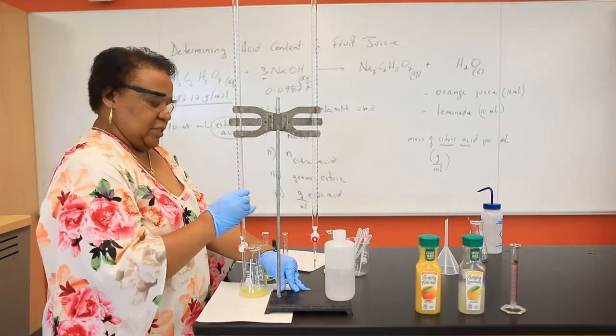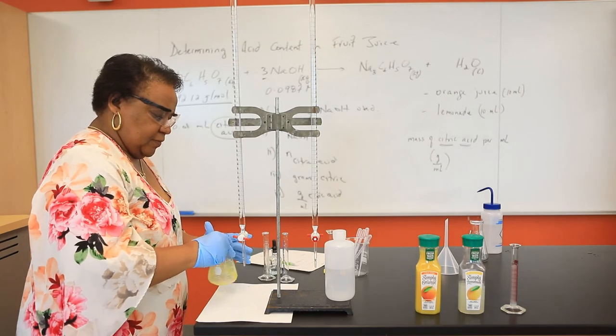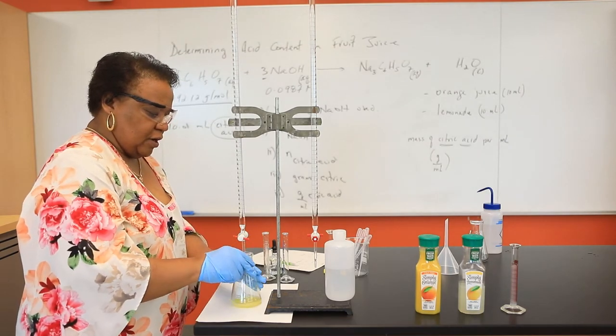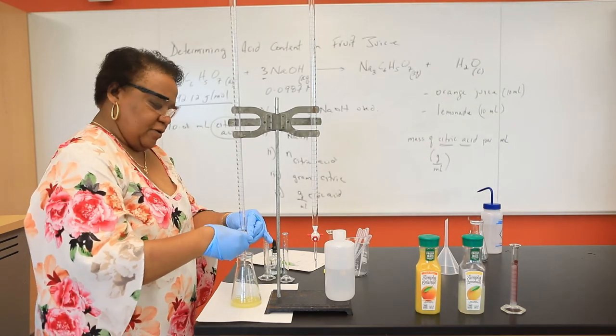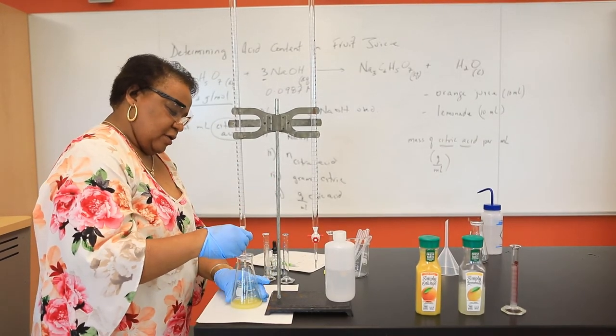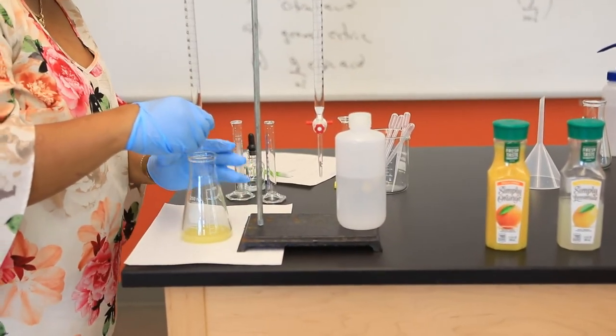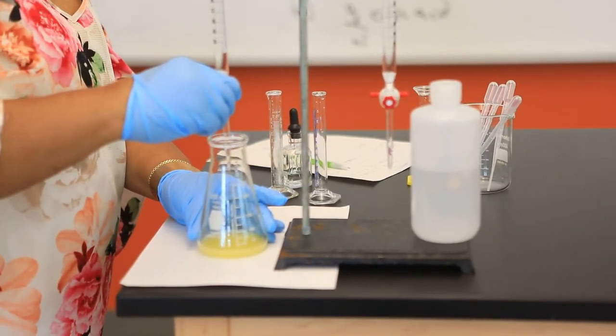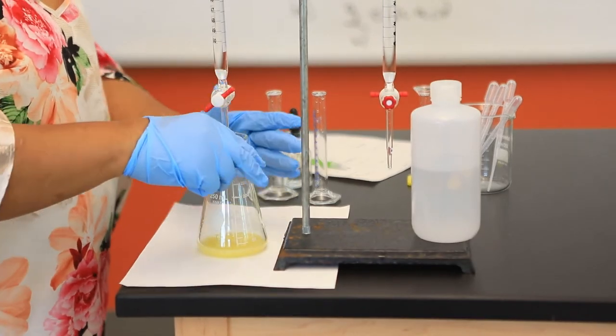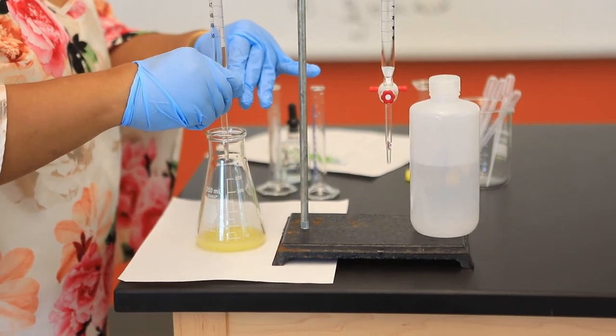The burette is filled with our sodium hydroxide solution. So slowly, I'm going to be adding the base, sodium hydroxide. This burette is void of any air bubble at the tip. I'm going to be adding sodium hydroxide slowly to my acidic solution, my fruit juice.